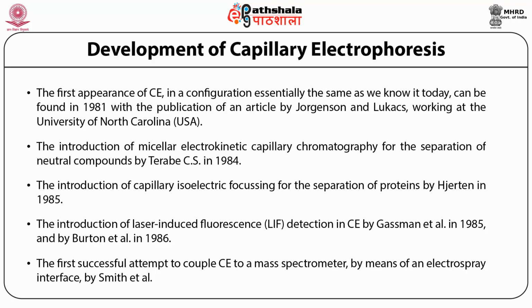Later, Virtanen and then Mikkers performed electrophoresis in approximately 200 micrometer internal diameter capillaries made from glass and Teflon respectively. In the early 1980s, Jorgenson and Lukacs advanced the technique by using 75 micrometer inner diameter fused silica capillaries. Jorgenson also clarified the theory, described the relationship between operational parameters and separation quality, and demonstrated the potential of high-performance capillary electrophoresis as an analytical technique.